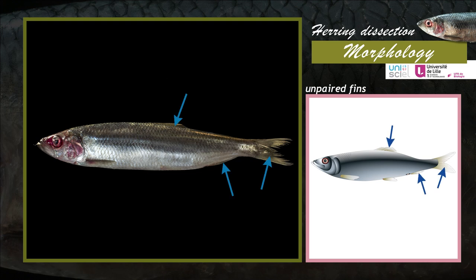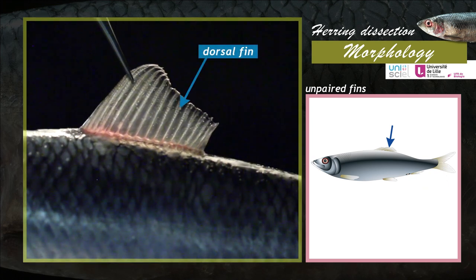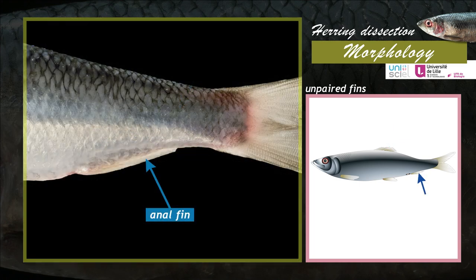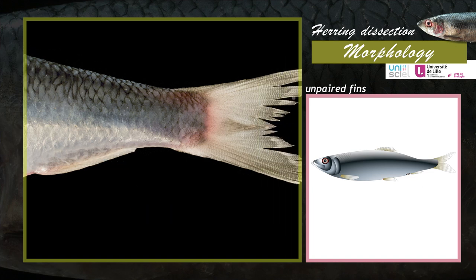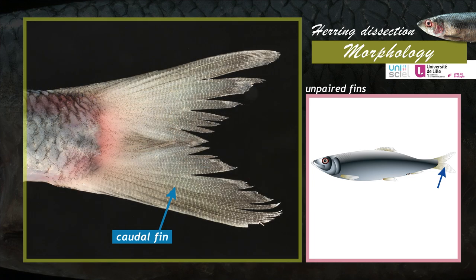The unpaired fins are located on the median plane of the animal. There are three different types of unpaired fins: the dorsal fin, the anal fin located behind the anal and urogenital papilla, and the caudal fin. The homocercal caudal fin is made of two identical and symmetrical lobes.